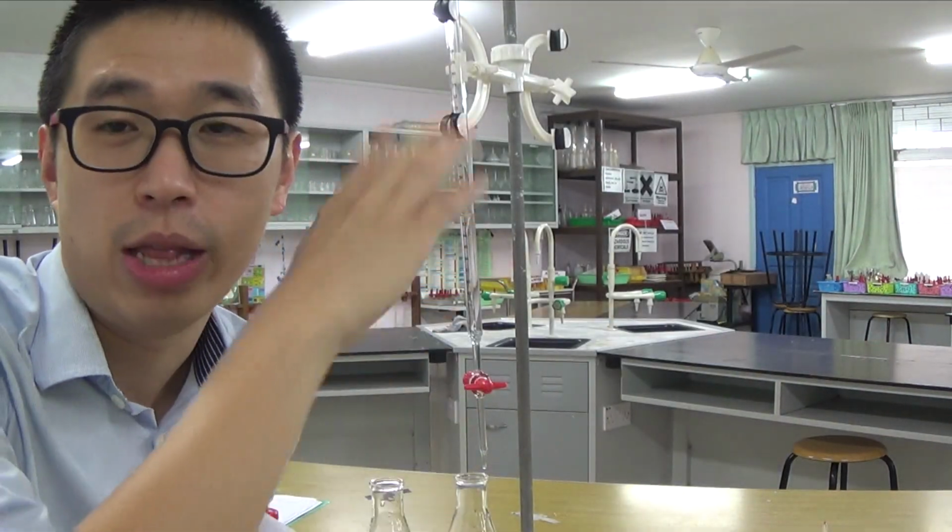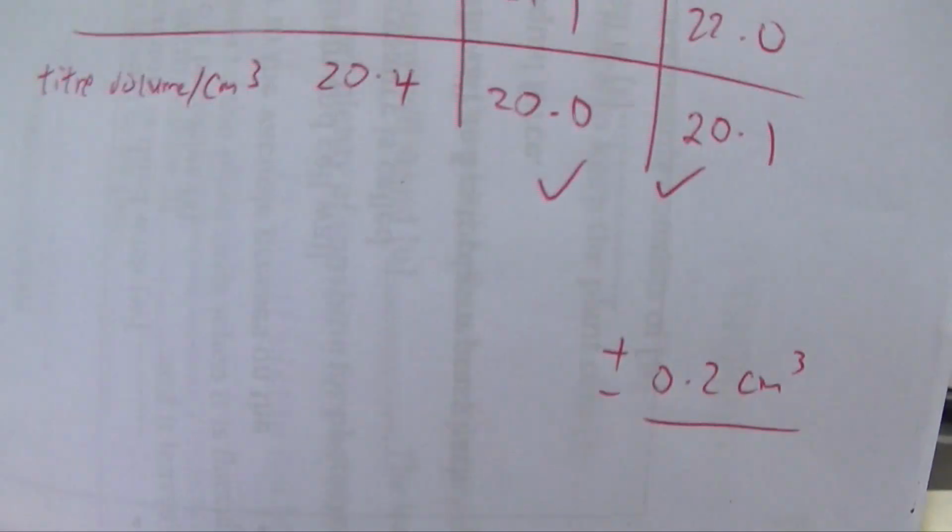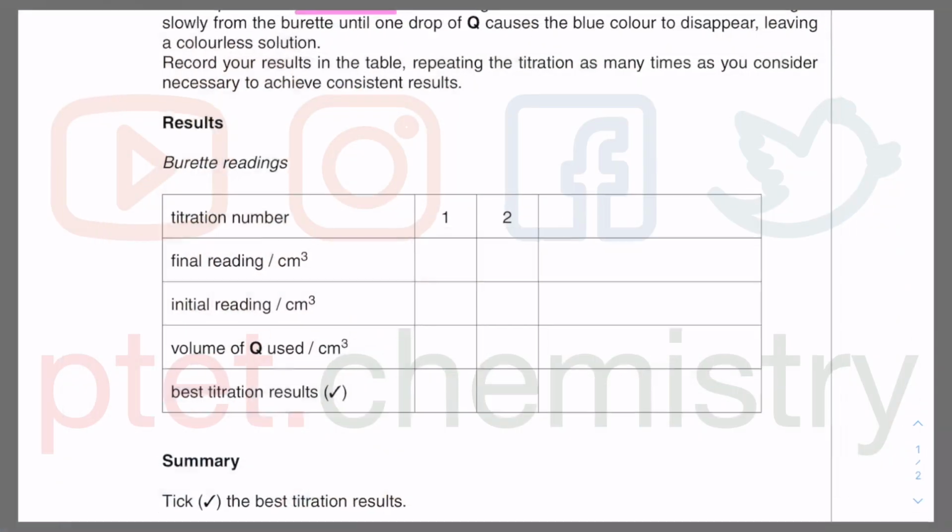But clearly I'm not very competent, hence I have got a bit of a difference, and we're only human, so we can obviously make mistakes with a little bit of 1 drop or 2 drops, but it should be within the acceptable margin of error, as you would know if you have done enough alternative to practical as well as practical paper.